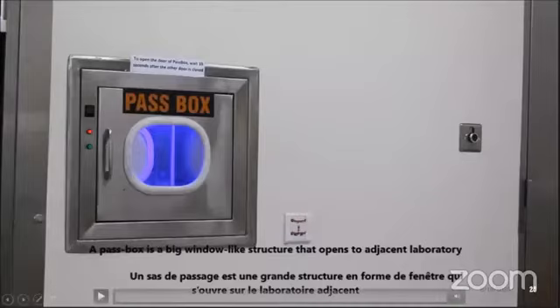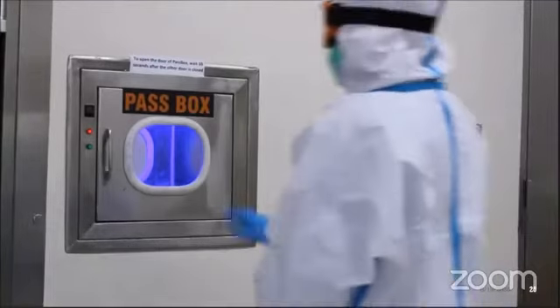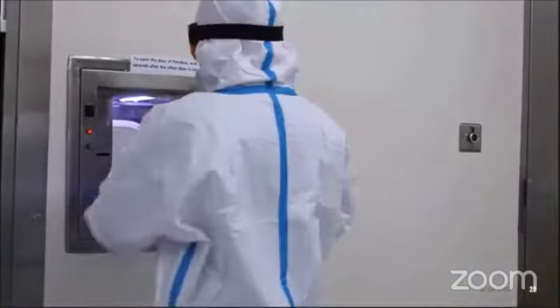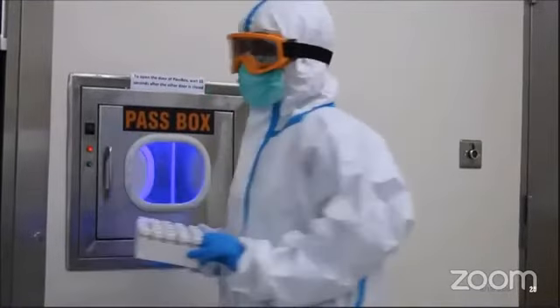A pass box is a big window-like structure that opens to the adjacent laboratory. It acts like a linkage between the BSL-3 and adjacent laboratory. It provides an entry and exit route of samples and small equipment.